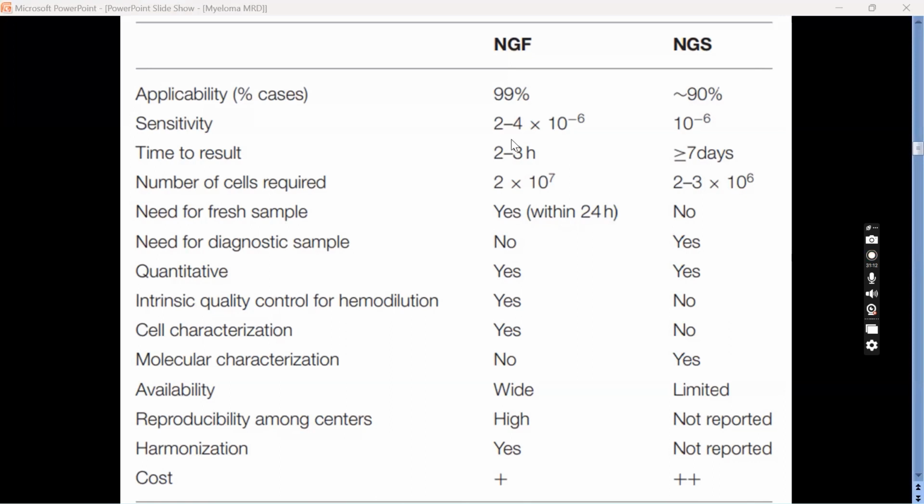Analyzing an MRD is very simple, especially in myeloma. It is not very difficult, because you're interested in the population expressing CD38 bright, you have other markers to refine it, and then you check kappa lambda. So analyzing an MRD and picking up the abnormal population by gating is relatively not difficult. The problem is in the hardware and the software.